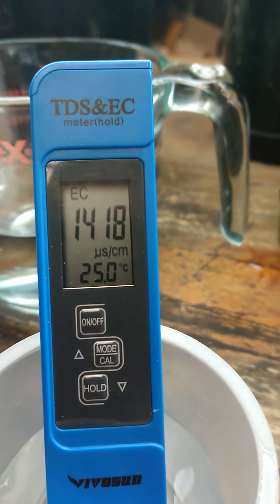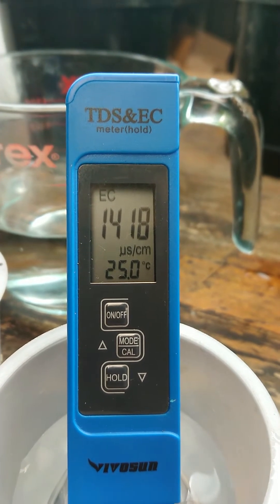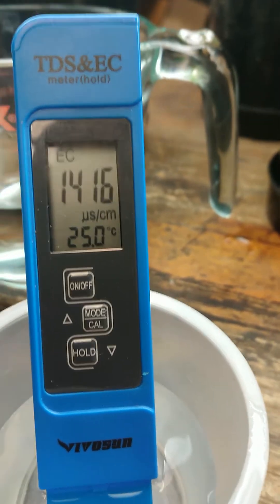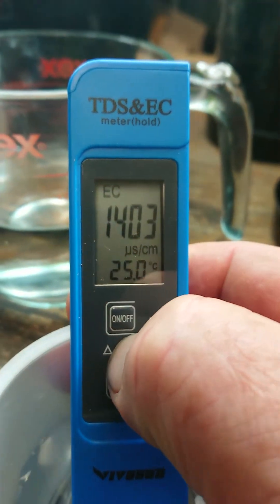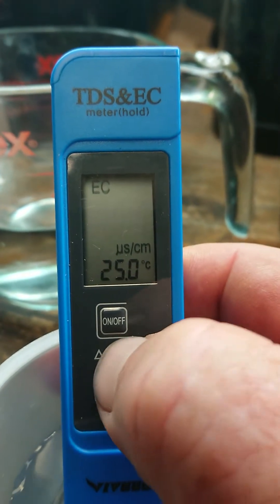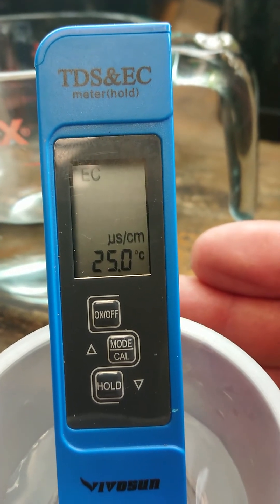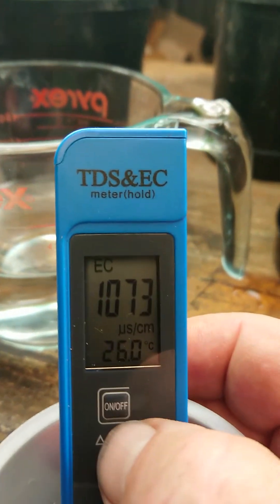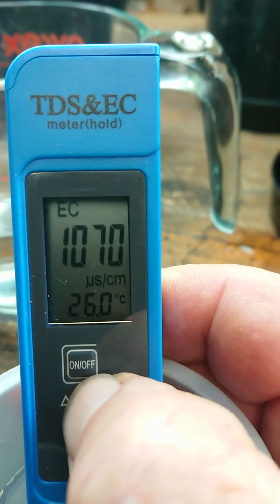Now in EC mode to calibrate this unit, what you do is press the mode/Cal button — the middle button — for around three to five seconds and hold it in. Once you've done that, the reading starts to flash. Now press the mode/Cal button again with the up arrow to increase the value, either one step at a time or press and hold the button and it will go up continuously.